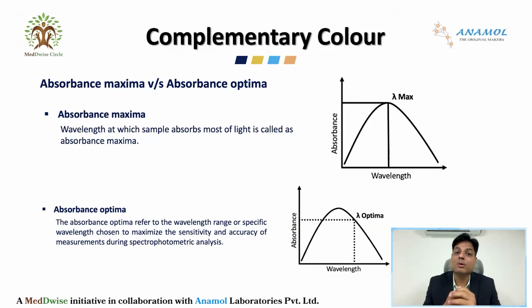Now, these molecules also absorb the light at 625 nanometers. So the total absorbance of the solution consists of the absorbance by the glucose molecule and also the absorbance of any molecule other than glucose. But do we want to identify any other molecule other than glucose? The answer is no. We only have to identify the concentration of glucose.